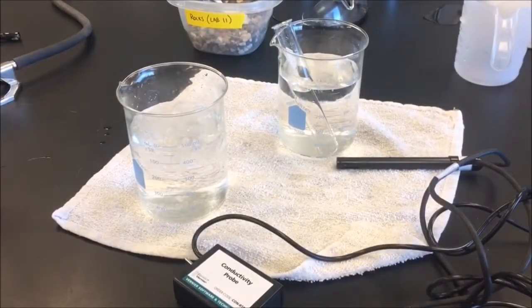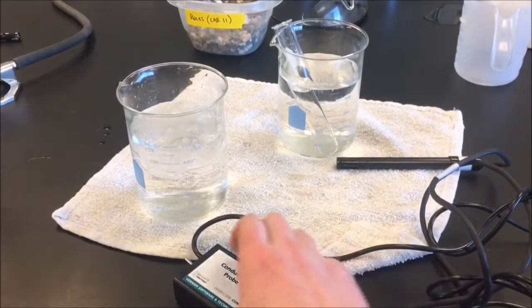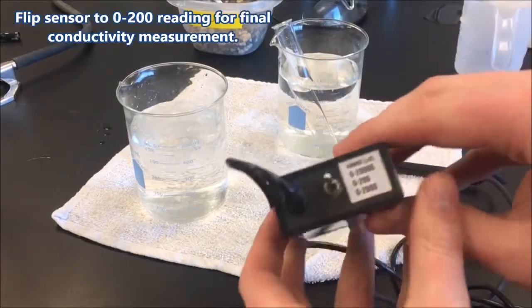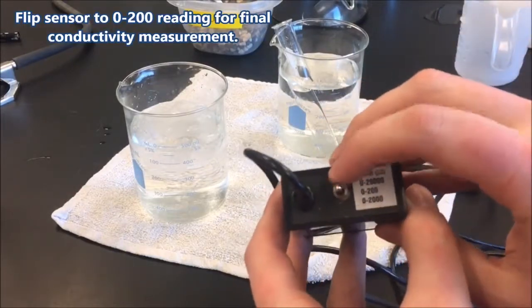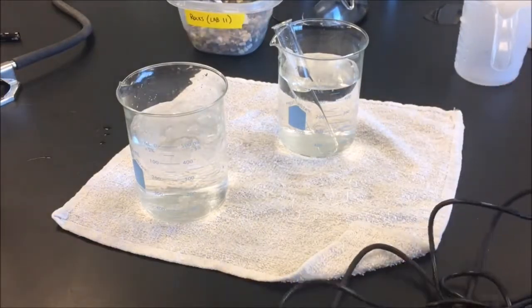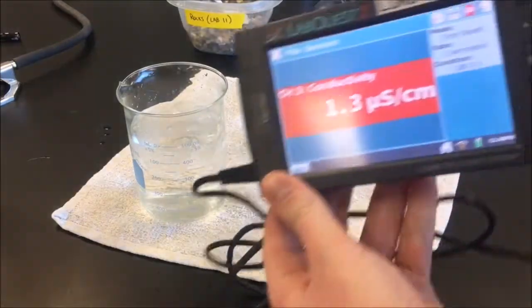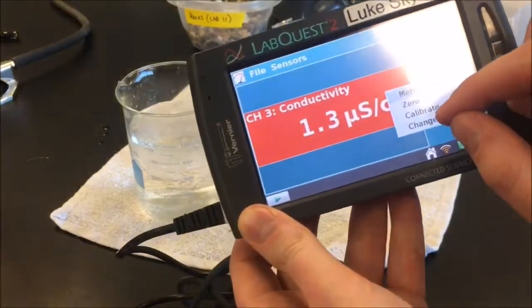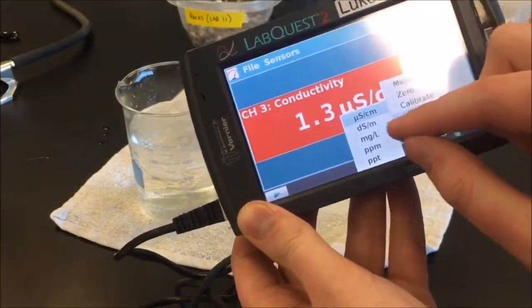So now we'll take our last conductivity measurement. Since we're expecting a much lower number, let's flip our sensor to the lowest setting, which is 0 to 200. Make sure that we're looking at milligrams per liter.